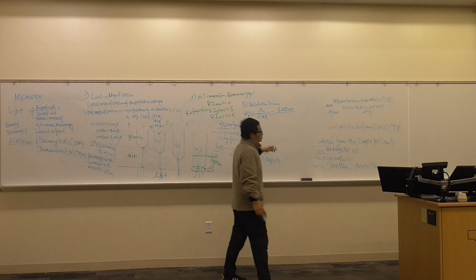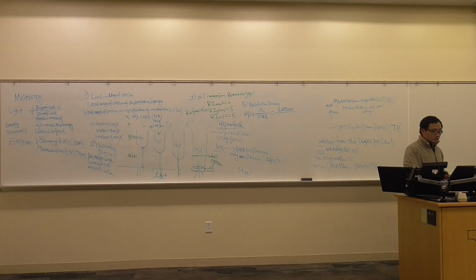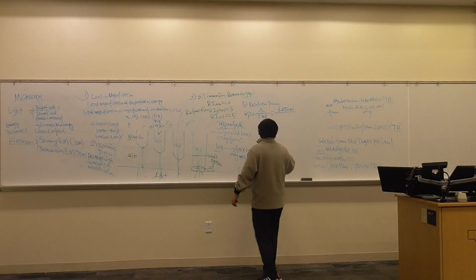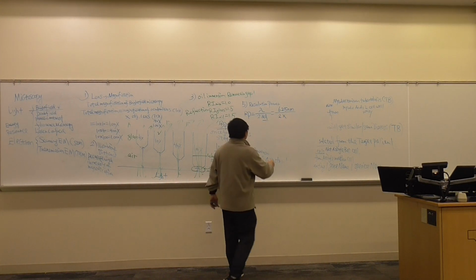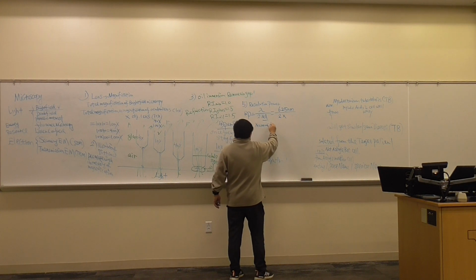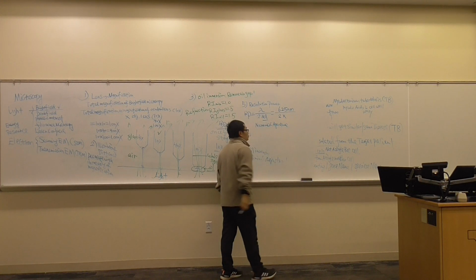2 is a fixed number; the calculation is based on the working distance, size, specimen, and the angle. It's a triangle formula. It's a mess, so we don't have to talk about that. 2 is a fixed number. So 2 right here. What is the other one again? Numerical aperture. What is that?